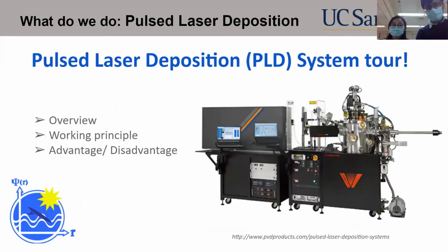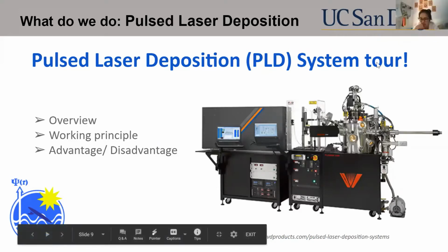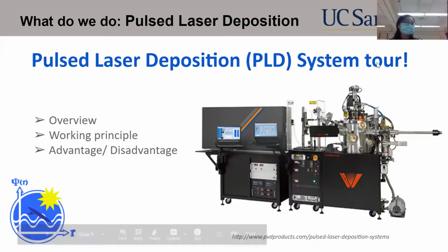So now we will go into the details of the pulse laser deposition system, and I'd like Don to take over from here. So I'll take over from here. And let me know where I should point if I have to. Okay, maybe you can start.